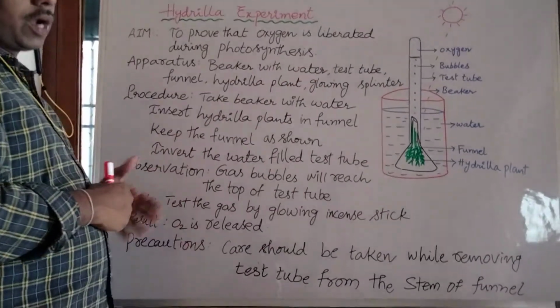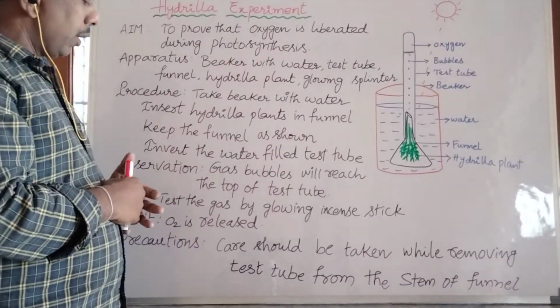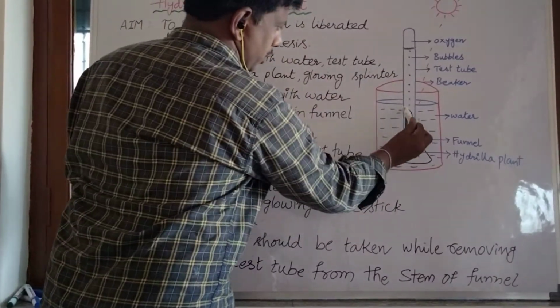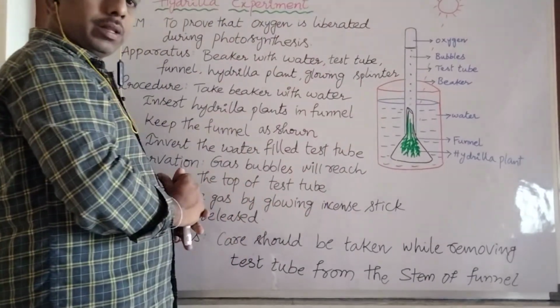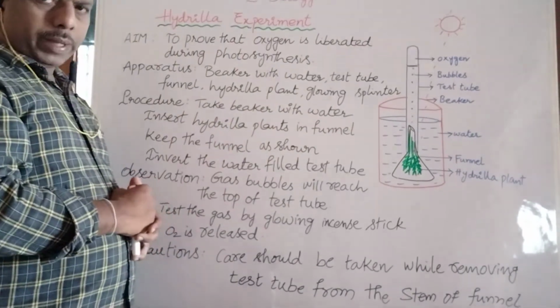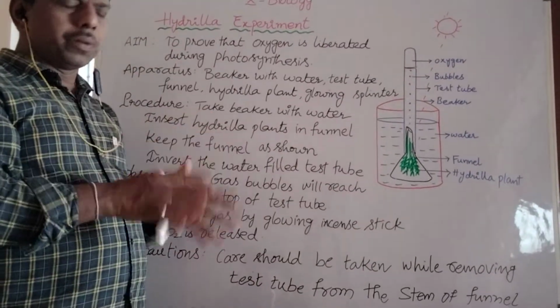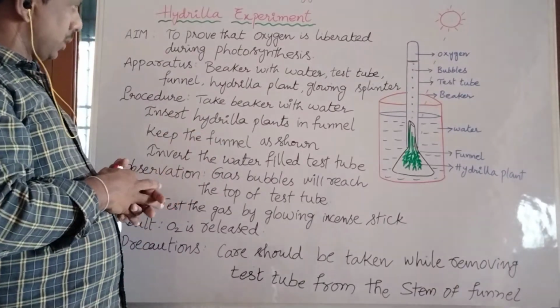And precautions. What precautions do we have to take in this experiment? Care should be taken while removing the test tube from the stem of the funnel. So this is the stem of the funnel. We have to take that test tube very carefully outside of the beaker. So that care is very important. In this manner, we have to do this Hydrilla experiment for the liberation of oxygen during photosynthesis.